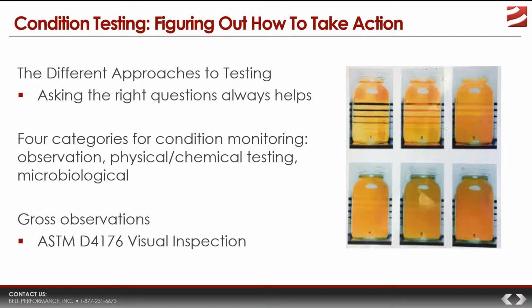So what you would do, I mean, there is a protocol you would do for this. What you would do, you don't just take the sample and you hold it up in the jar and you say, it looks clear. No, what you do is you've got it in a sealed container and you swirl it vigorously. You swirl it hard for about 30 seconds, and then you hold it up to the light. And now what you'll see a lot of air bubbles that are swirling around in it.